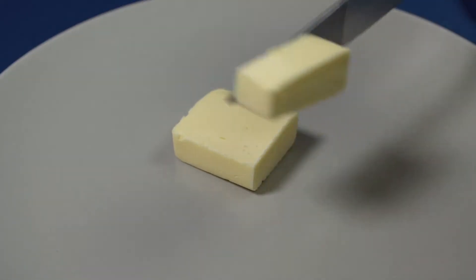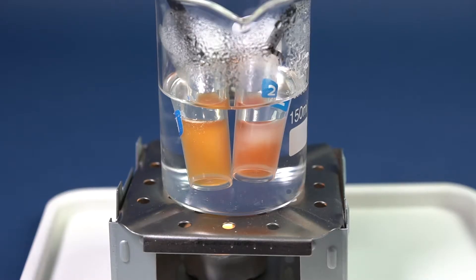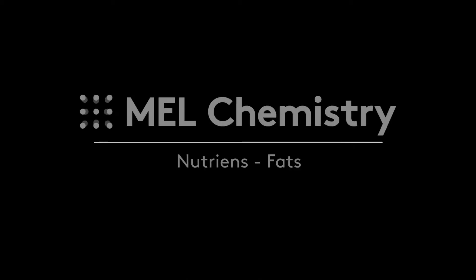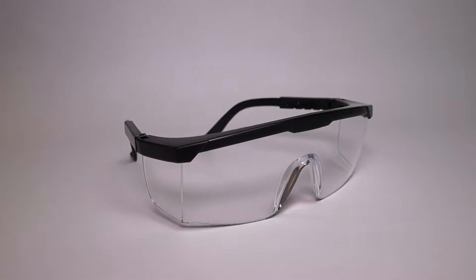Vegetable oil and butter are used in many recipes, and in many cases, they are used to substitute each other. Today, with the help of a nutrition set by MEL Chemistry, we will learn what the difference is between the vegetable oil and butter fats in chemical structure.